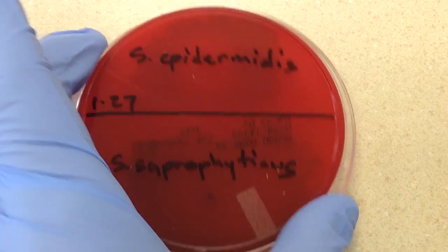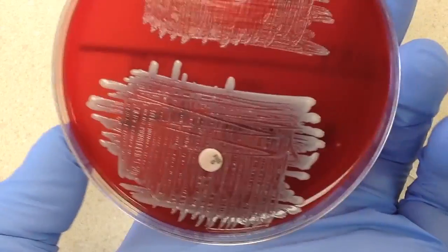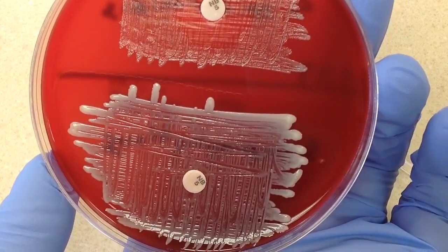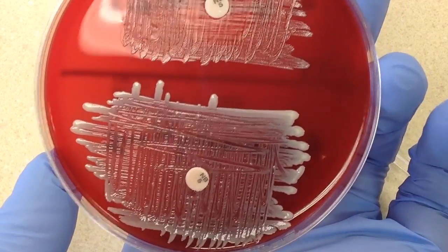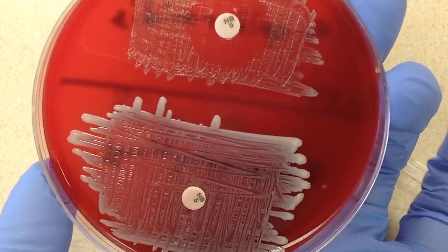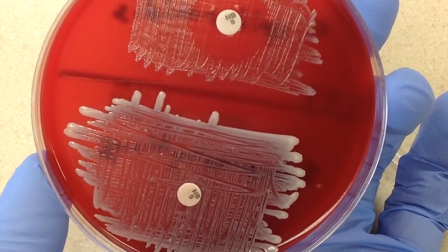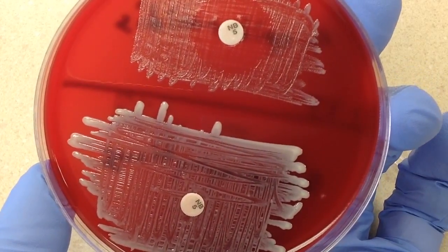Yesterday, I went ahead and set this up. What I did is I made a lawn — on the top we have Staph epidermidis, and on the bottom we have Staph saprophyticus. I made a light lawn and went ahead and put a Novobiocin disc in the center of each of the lawns.